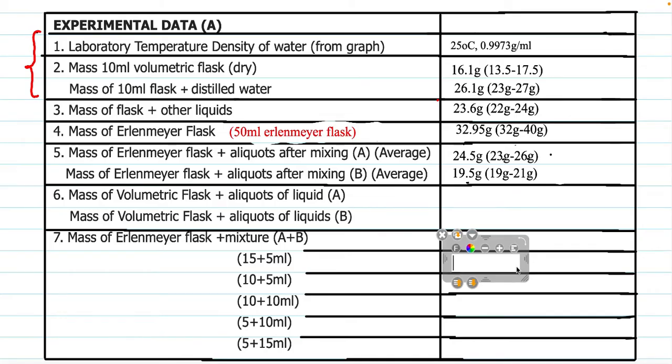All right, so for this one, we have 18.71 grams. But the range of this value is 17.92 grams to, let's say, 19.1 grams. Okay, so it's actually correct. This is the range of values here.